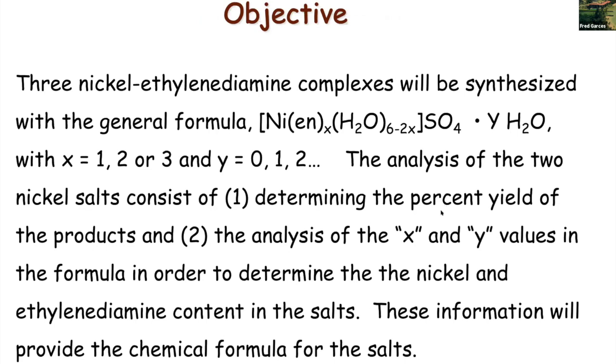You basically, for this portion of the lab, you guys are going to synthesize nickel ethylene diamine aqua sulfate salt. Again, the reason why we call it a salt is because there's a cation and anion. This whole thing in brackets right here is the cation. This SO4 is the anion, and then you can have water hydrated sticking to that compound.